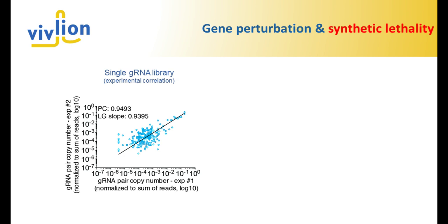And what we do here is we generate a combinatorial library of a protein family, and we screen this library first on its own. So that means we only target each gene individually. So it's not a combinatorial reagent first, but it's now a single library just targeting those genes, and then seeing which of those genes, when it is deleted, induces the phenotype that we are interested in.